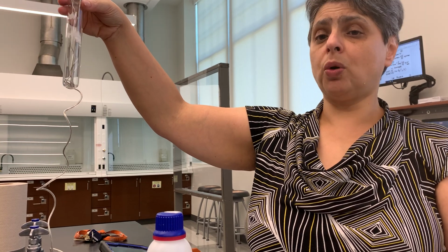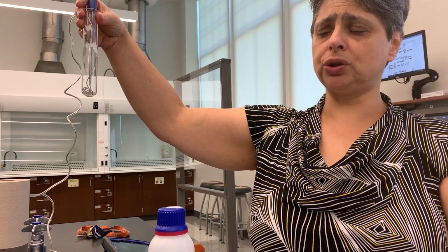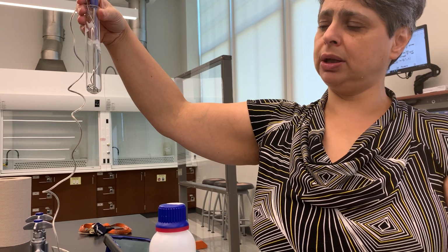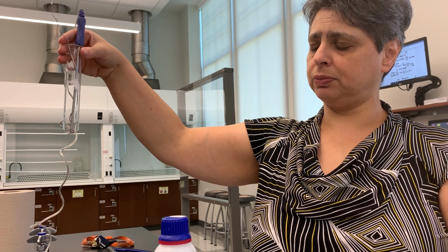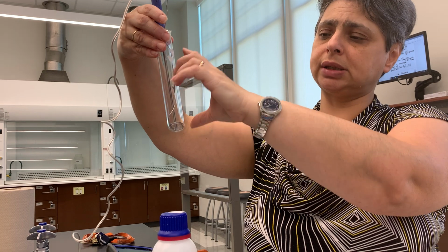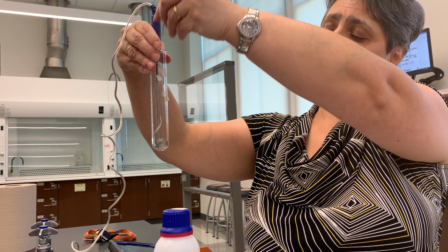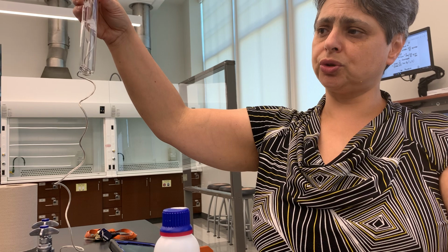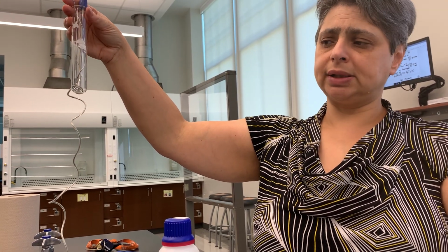And then you would add more ice, significantly more ice, to your water bath. Because remember, the solution would freeze lower than the solvent, so you need more ice to make your ice bath colder. And you would then place the assembly into the ice water bath, making sure that the entire solution in this instance is covered with water in the beaker. And then you would begin freezing your solution and find the freezing point of the solution based on the cooling curve it gives you. And then you would do the necessary calculations.